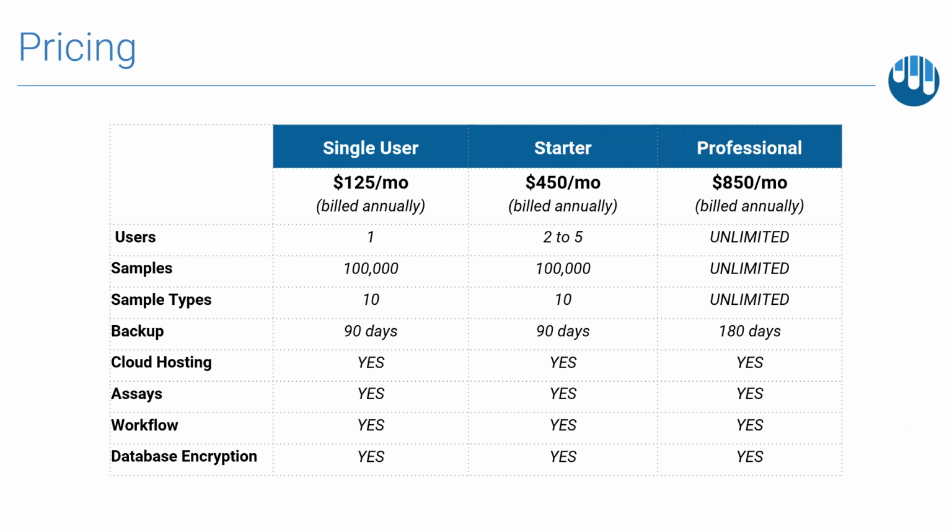And really, we wanted to make Sample Manager as accessible as we possibly can to laboratories of all different sizes, as I've already mentioned. And to achieve that, we undertook a very thorough review of offerings in the market today and came up with what we think is a highly competitive, but also an incremental pricing framework.